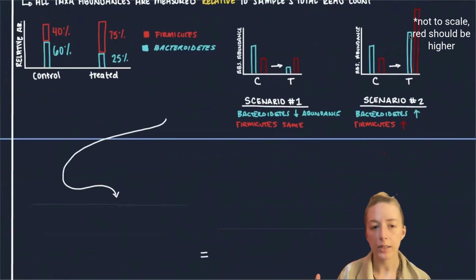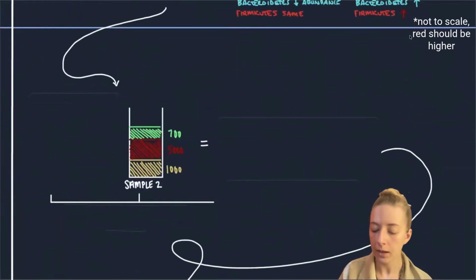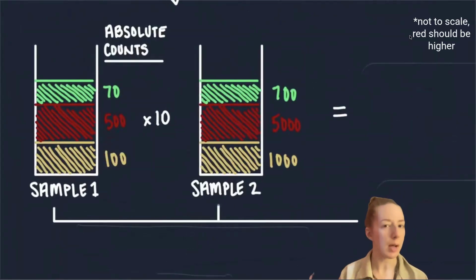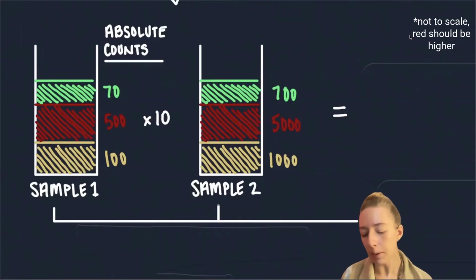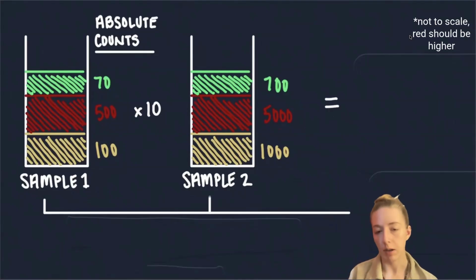Another problem this brings is one of scale. It's not impossible to get an idea of the absolute abundance, but it requires different assays, different experiments to do. But as far as our 16S microbiome data, here's another distortion or limitation.